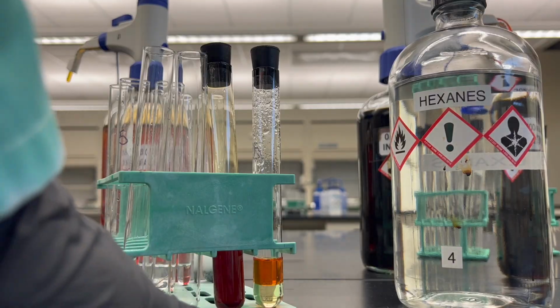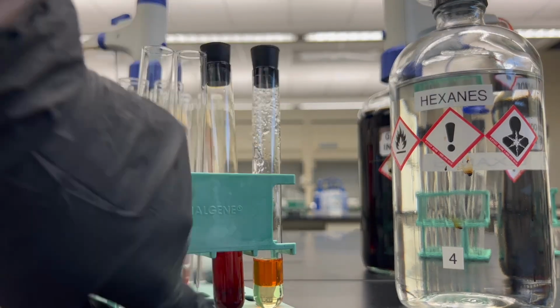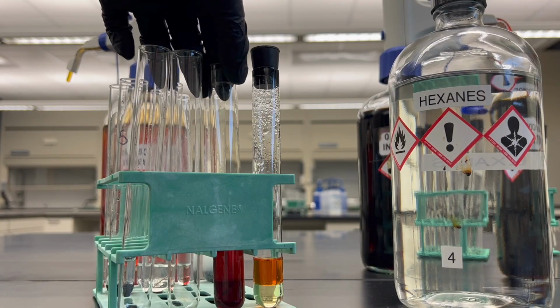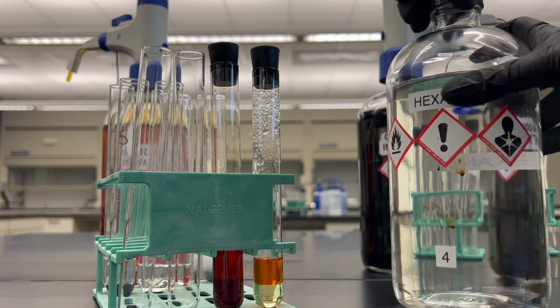Because the iodine was in methanol, which is polar, you start to see the two layers forming on iodine. It may take a second for it to split, but we'll see that.